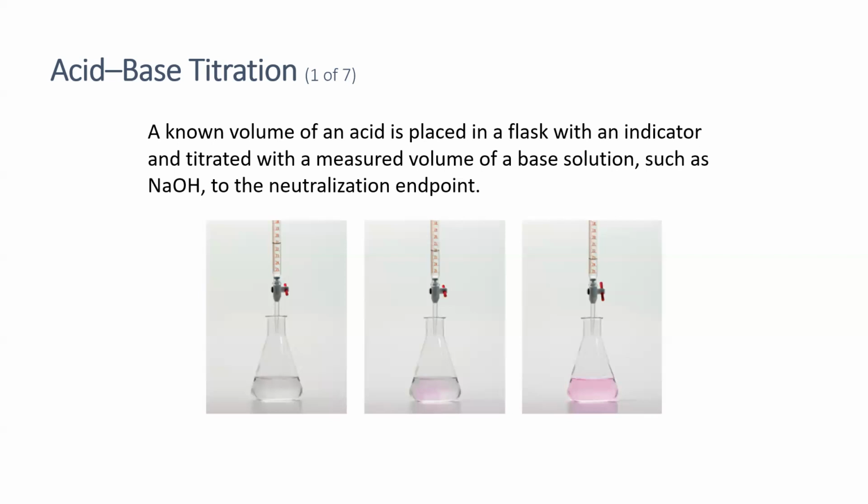But you can still count the number of drops that it takes you to get to the endpoint, and you will have done a calibration where you'll know exactly how many drops is equivalent to a milliliter using that Beral pipette. So we'll still be able to get the volume of the sodium hydroxide solution added to get to the endpoint.